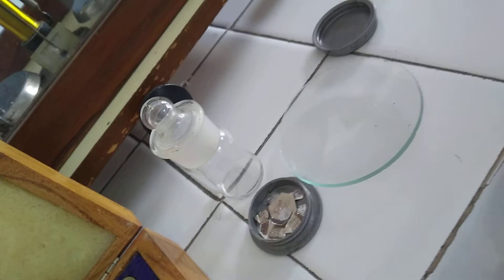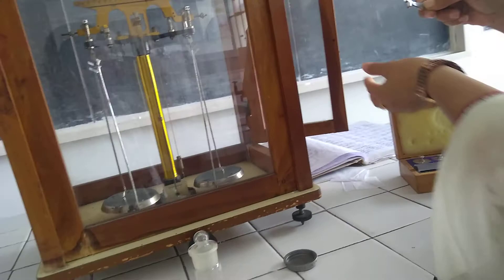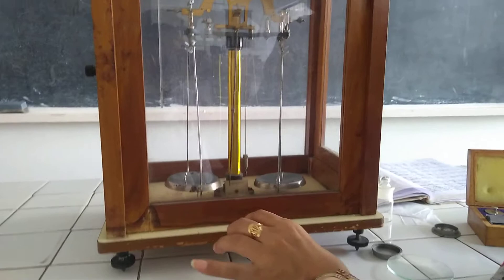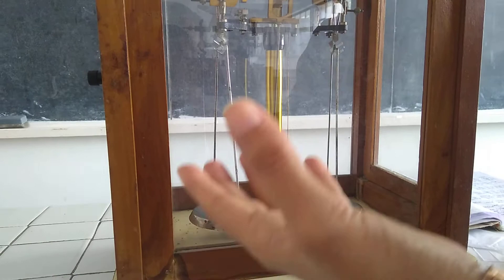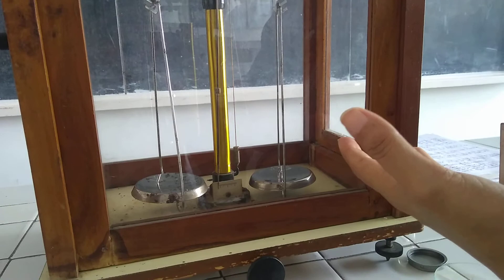Now let's demonstrate the working. This is a 2-gram weight and I am placing it on the right-hand side pan. Weights should always be placed on the right-hand side, while the sample should be placed on the left-hand side. Moving the knob, you can see the beam oscillates toward the heavier side. Since my right-hand side has more weight, the left-hand side is lighter. This demonstrates the working of the analytical balance.